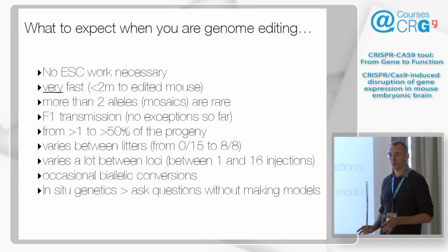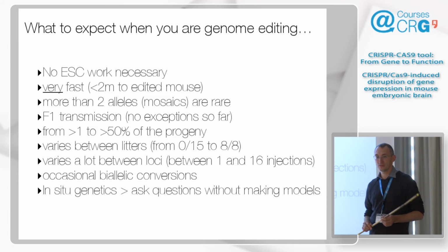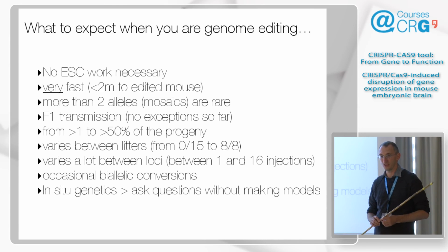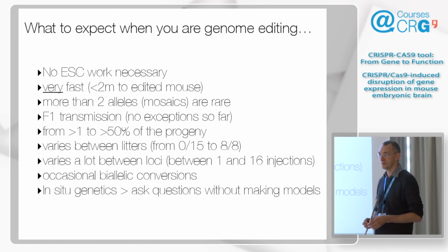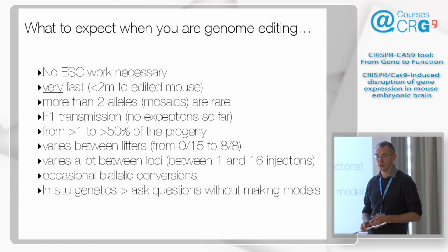Just to summarize, what can we do? I think you're all convinced by the end of the course that whatever you were thinking of doing before you came here is possible, and you should just go home and do it. It's very likely to work. In terms of making mice, I think at this point it's completely unnecessary to go through all the trouble of making ES cells, with some exceptions.